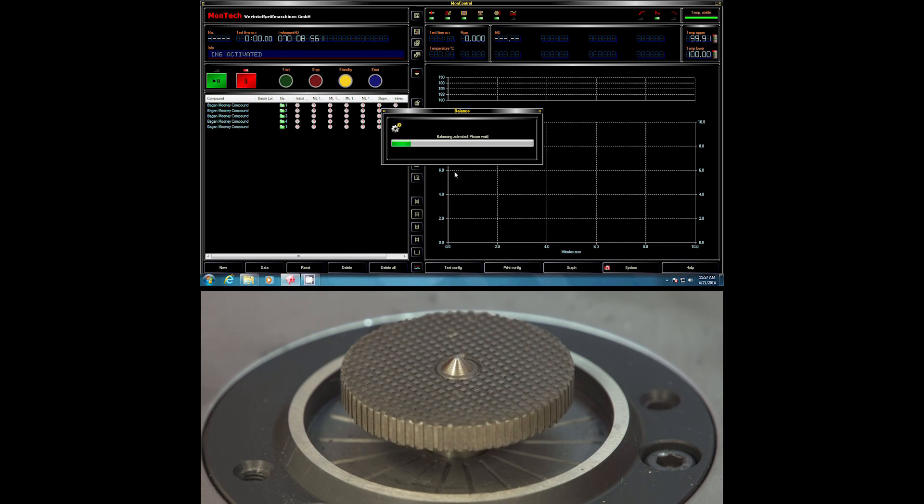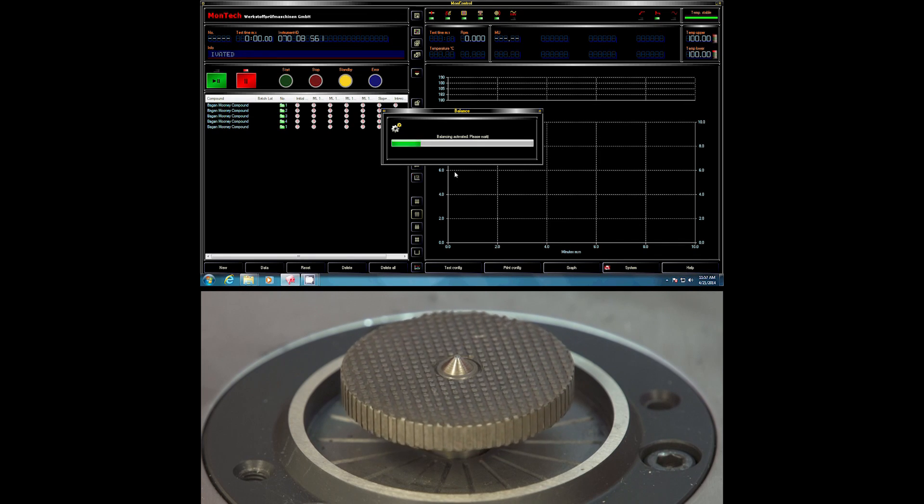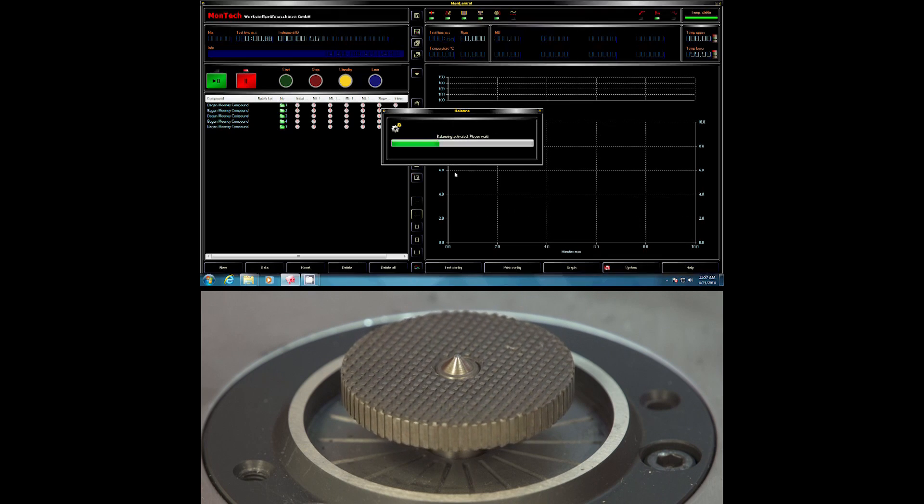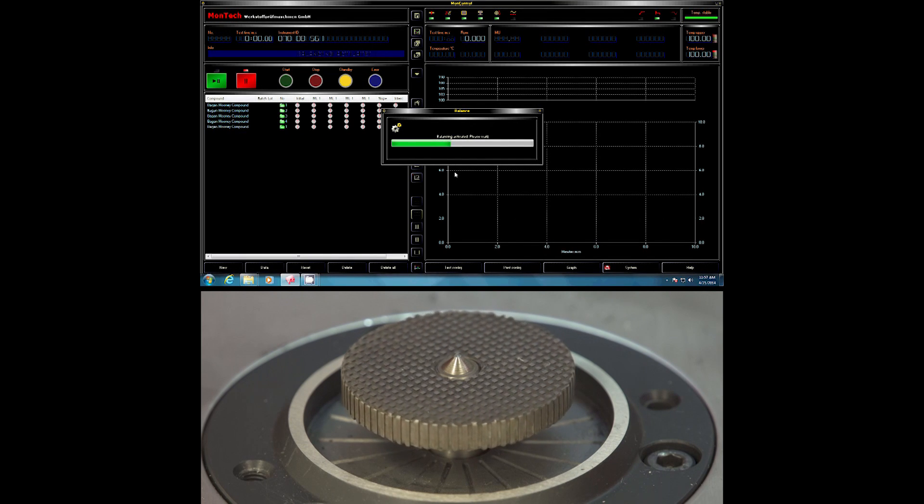The rotor is turned with 2 rpm and the friction of the seal is measured. Please be patient to complete the balancing.